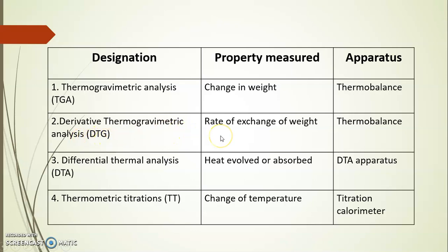In this method, we determine the rate of change of weight, and for this purpose we also require a thermobalance. The third method is differential thermal analysis, DTA.